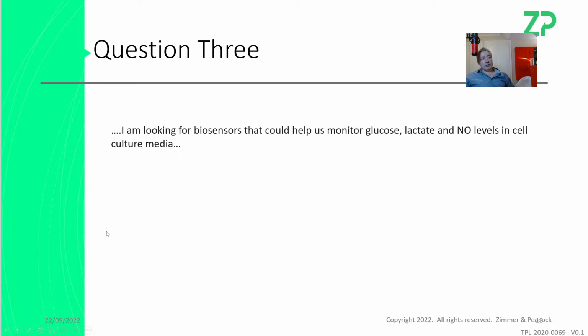So this is a tough question. I'm looking to monitor glucose, lactate, and nitric oxide in cell culture. The following slides, Aftab was just saying for characterization, so I'm just watching the chat as well. Cyclic voltammetry is something we often use for characterization. It's true. Like when we're doing biosensor building, cyclic voltammetry is something we use for characterization.